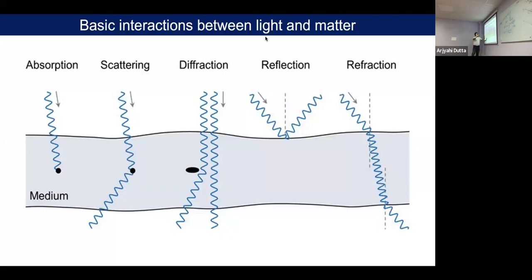In electron microscopy, most of the time we are considering the scattering because we are talking about the transmitted electron beam. And I have mentioned a couple of times that light is not damaging, but X-ray and electron are damaging. Why? Because this medium can absorb that. When there is a high energy electron, it will be absorbed and start damaging the sample. It will start damaging anybody. If it is graphene or any material science sample or any metal, like gold or silver you want to see, you cannot see that much problem. But for a soft material or a biomaterial, it is very problematic.